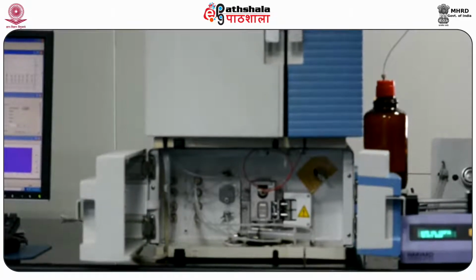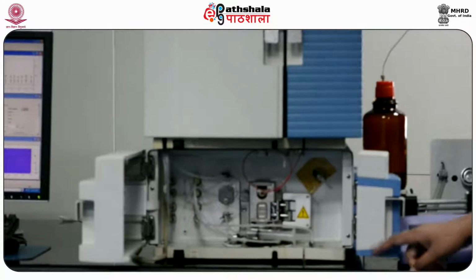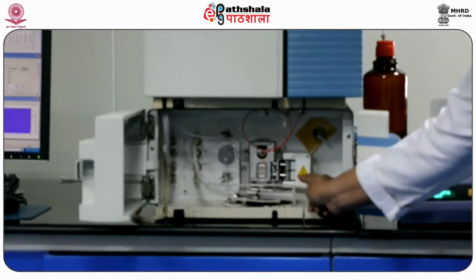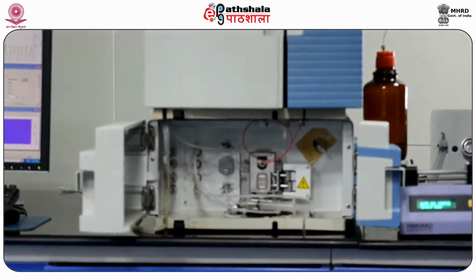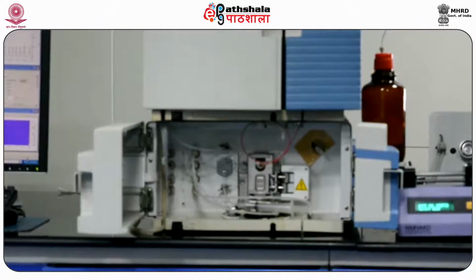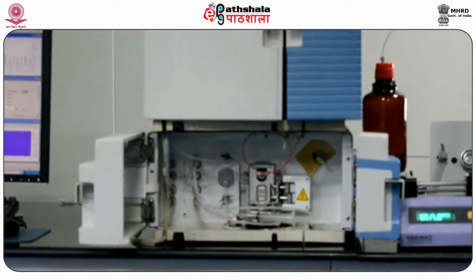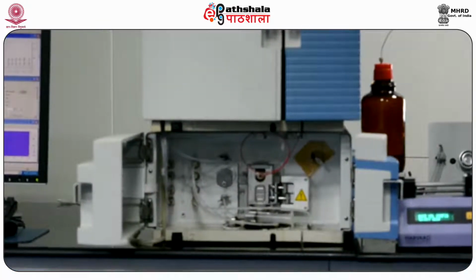This HPLC comes under the classification of ultra high performance liquid chromatography. It is capable of withstanding pressure up to 15,000 pounds per square inch, which is multiple times higher than that of a normal HPLC, and it can handle columns with a particle size of 1.5 micrometer also. Before this you have an online membrane degasser.